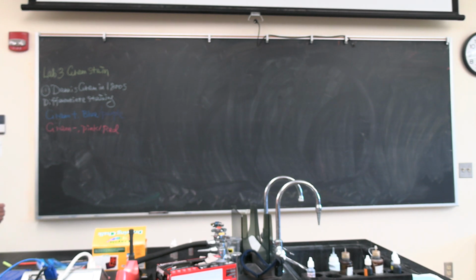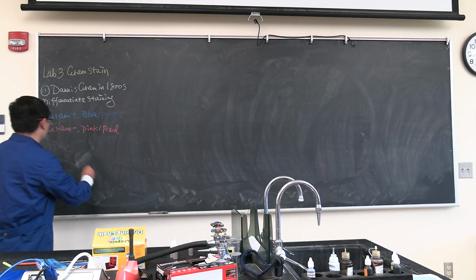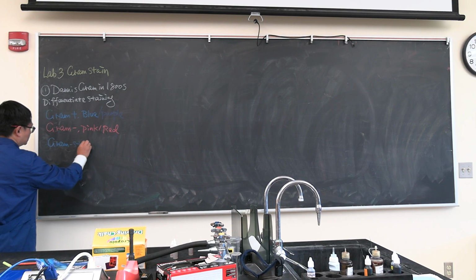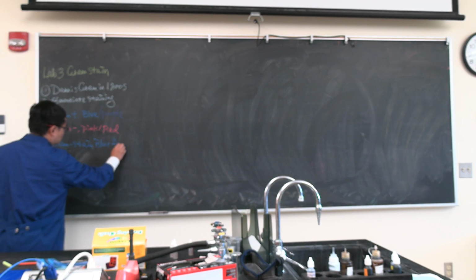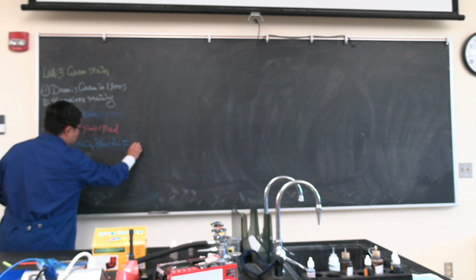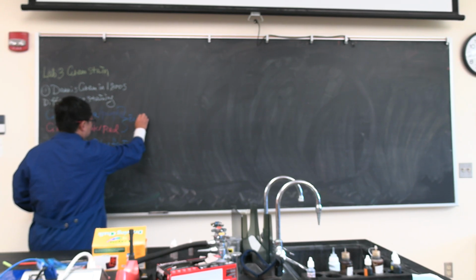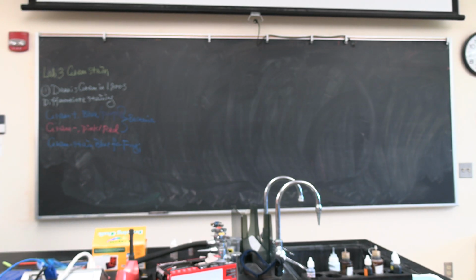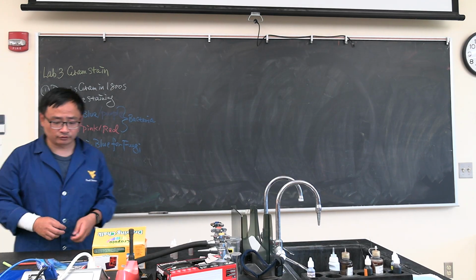This is for bacteria. We mentioned in the lecture, for fungi, we all say gram stain blue for fungi. And this is for bacteria. Okay, that's a very simple story behind it. Now, let's move on to today's work.